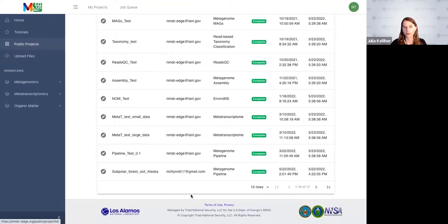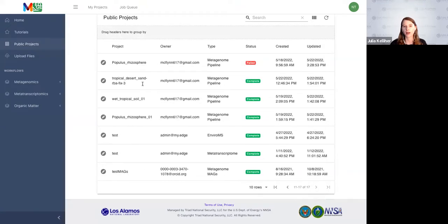And Mark, who I want to give a huge shout out to for being amazing, along with Mihal and everyone else over the weekend who helped to make sure all the test data was run. There are 4 new test data sets that we really wanted in there that are actually data from the NMDC portal that you are welcome to explore, that we'll talk about kind of the different microbiomes that have been run by the NMDC and the variety that can be run with these workflows. And we have these as examples for all of you.